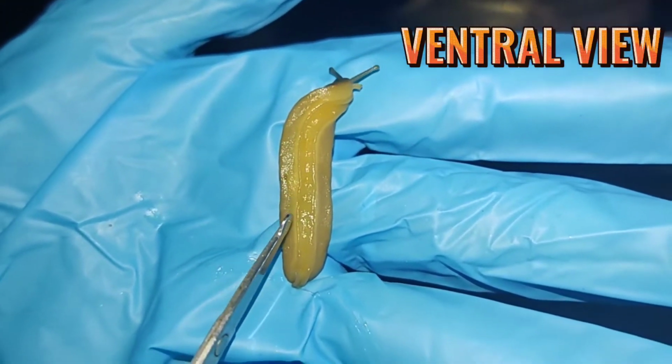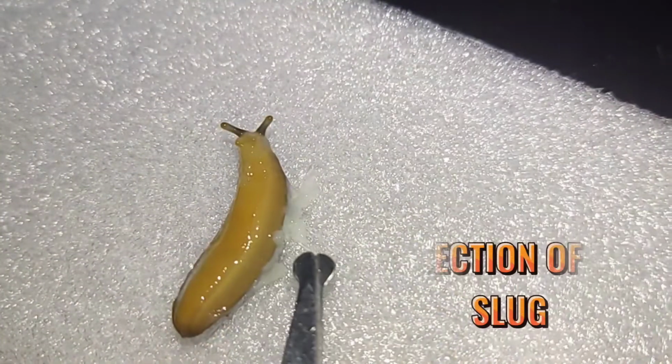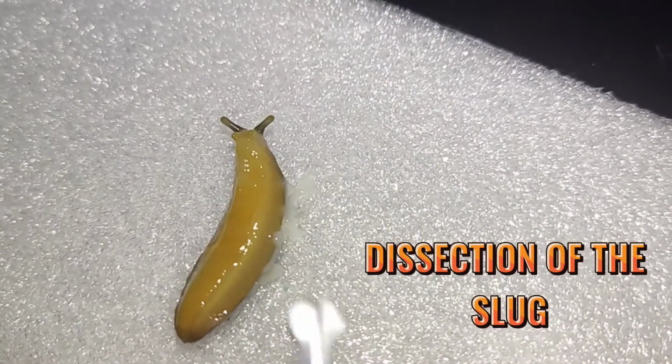The anal opening is located at the posterior end of the slug. And now, let's proceed to the dissection.